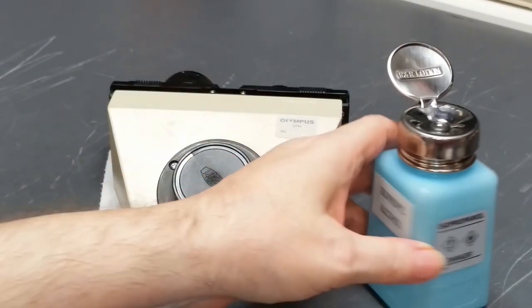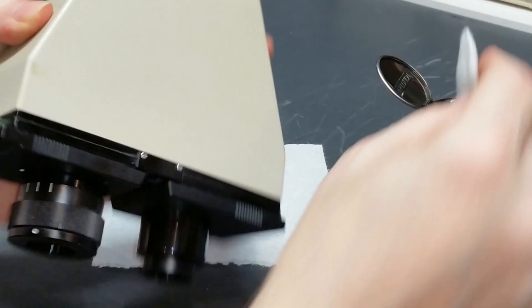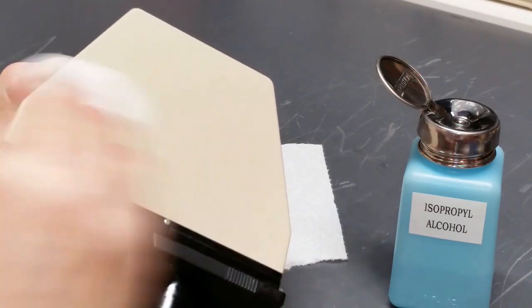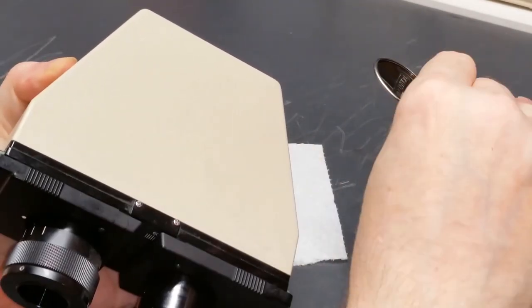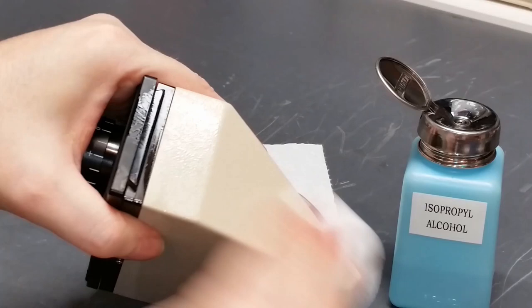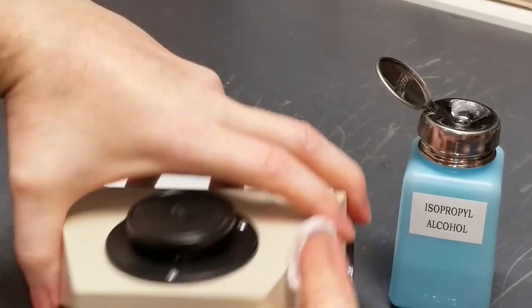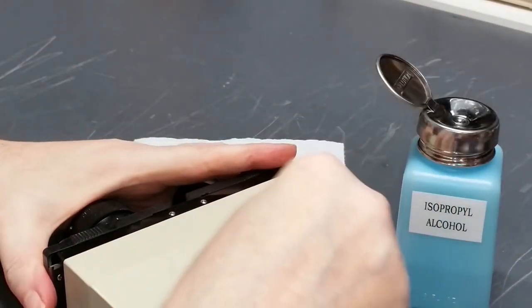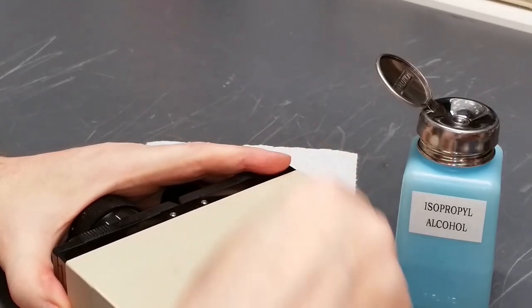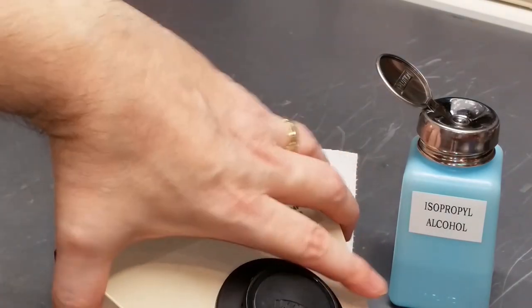Next thing I'm going to do is take a little bit of isopropyl alcohol and a couple of cleaning pads, and just clean the exterior here. These things are usually pretty grody by the time you get them. This one is really not too bad, but there is some stuff coming off on it. I got a little bit off there — that was worth doing. So let's start taking this thing apart.